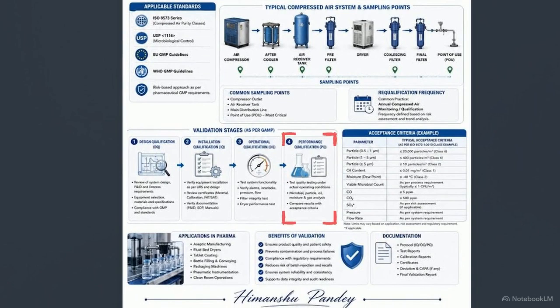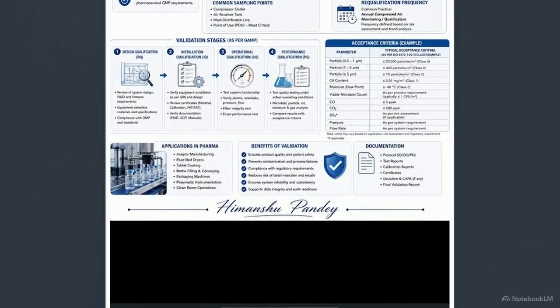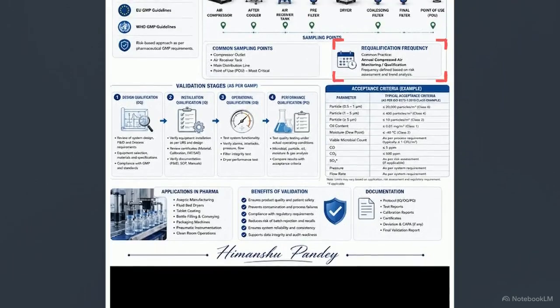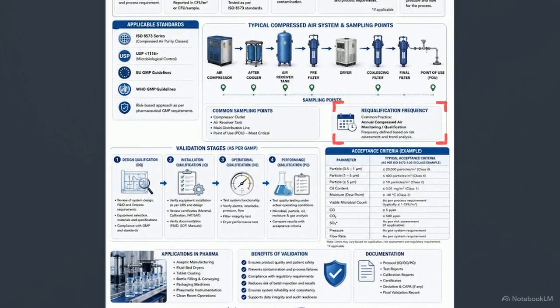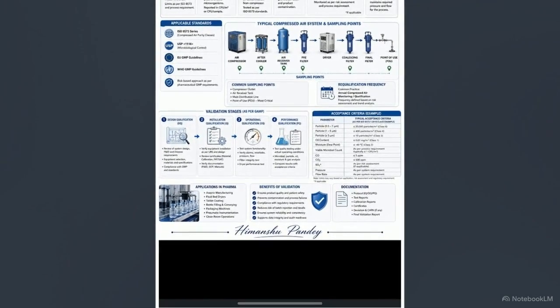Technicians pull physical samples to measure the ISO parameters. Stage 4 is data review, where those real-world sample results are compared directly against the regulatory limits. Finally, the process ends with reporting and approval to document the findings. To maintain compliance over time, facilities must perform periodic revalidation, typically scheduled every 6 to 12 months or immediately following major system maintenance. Executing this strict chronological sequence ensures that a handful of isolated air tests become a legally defensible, ongoing record of facility control.